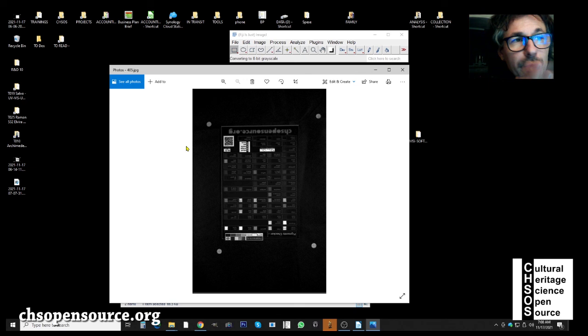So far, what we saw was the editing, the preparation of the images. That was necessary because we started from a standard digital camera modified for UV-Vis IR, but it was a standard camera, not a monochromatic camera like a black and white one. So we started from a color camera and then we edited the images. So far we have reasonable black and white images ready to be loaded into the MSI software.